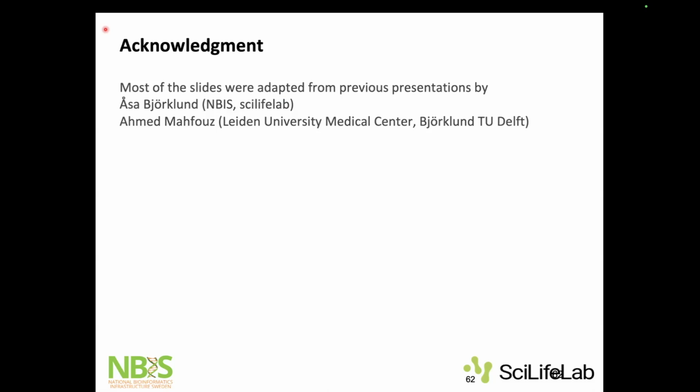Can I just comment there? Let's say that you are working with a disease state or a tissue that is rare to find. It's still better if your reference is Smart-seq but biologically very close to your data set than to have something that is only healthy controls from 10x. So I think the biology still matters more than the technology, just to keep in mind. Yeah, that's true. Thank you.